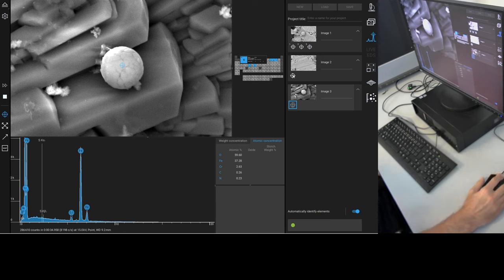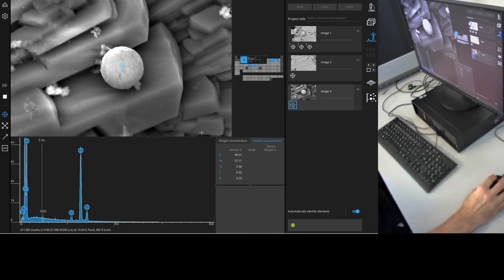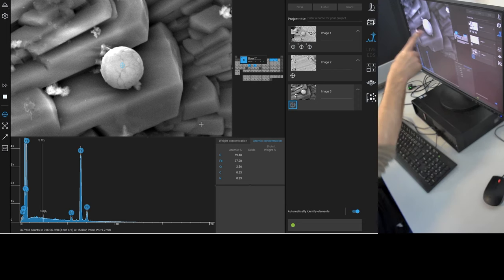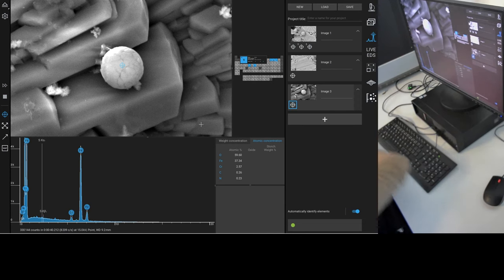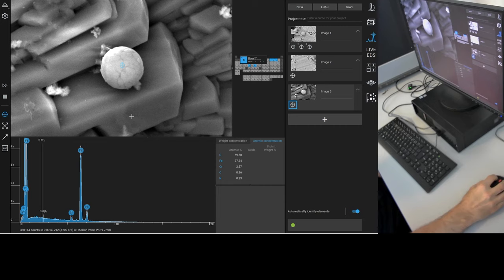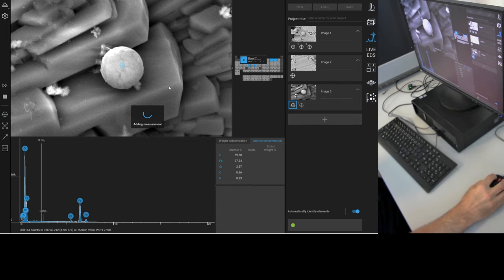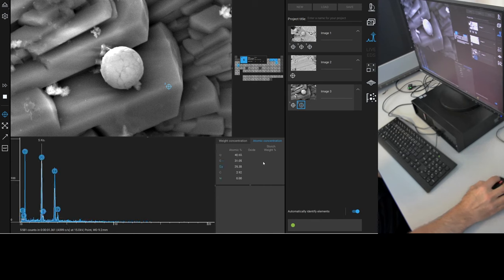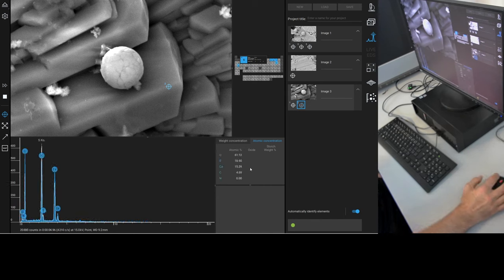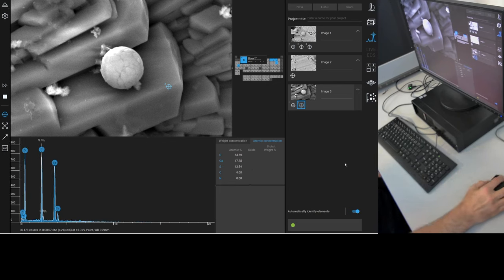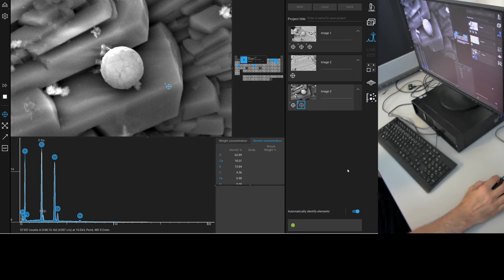I just want to know where Malcolm's getting all these iron-rich crenelated microspheres and why he's individually placing them at the end of calcium sulfate structures. Well, we've just got to figure out a way to sell them. So let's have a look to see if this really is calcium sulfate. We have calcium, sulfur, and oxygen. What a surprise. Not really. That is the story.